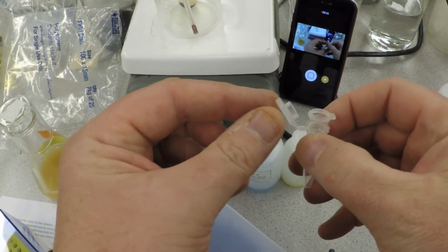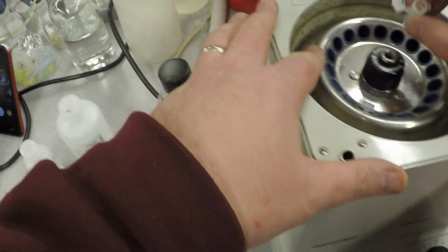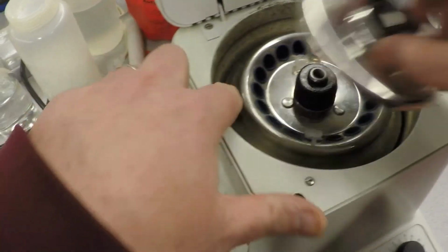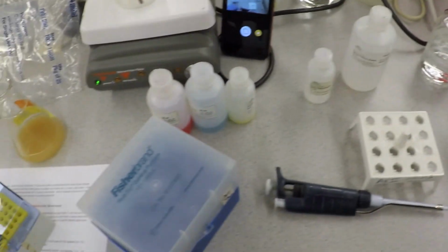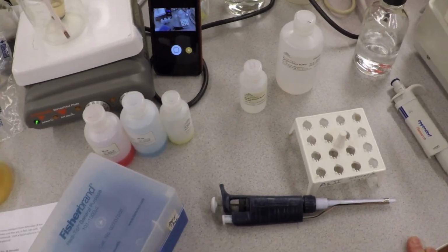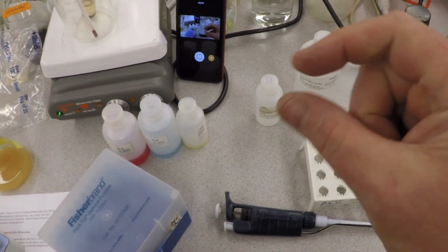You can't close the top. You just leave it like this and it will spin just fine, okay? It seems sacrilegious, but it'll be good. I tend to put it over on the side like that, so the top is kind of leaning over a bit. Switch it back on. And it says 30 seconds. And now what we'll have is our washed and clean plasmid down in our little collection tube.